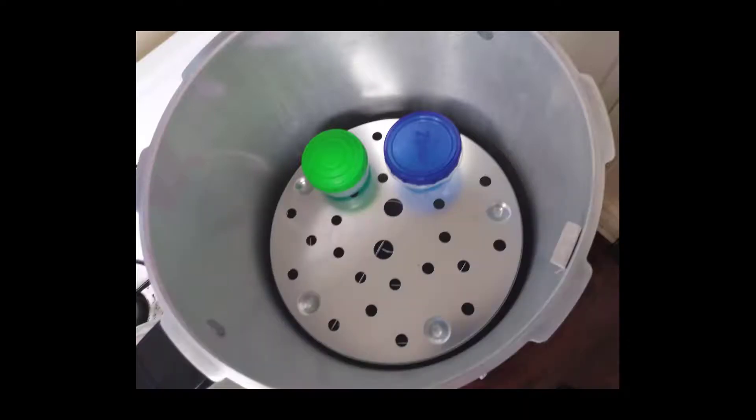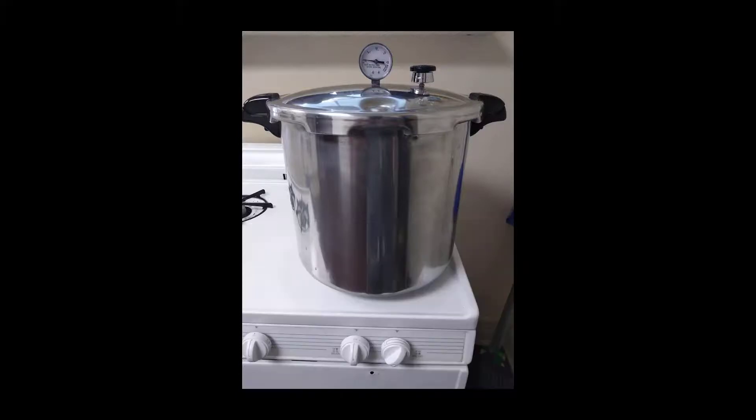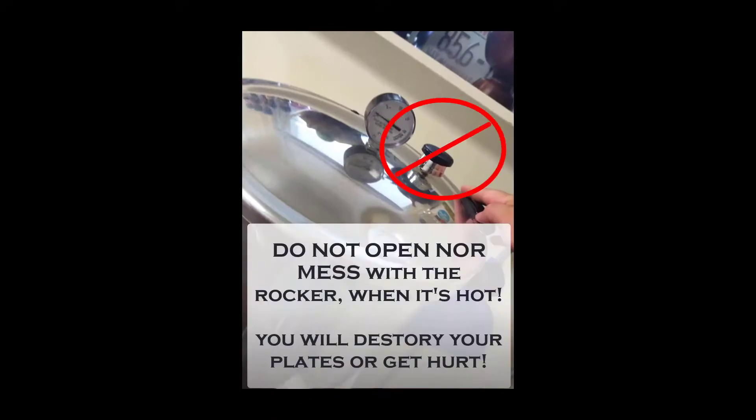Once you've filled all your plates, add them to the pressure cooker and cook them until the PC reaches 15 PSI. Once at 15 PSI, pressure cook them for 40 minutes. When they're done, allow the PC to cool — don't release the pressure.